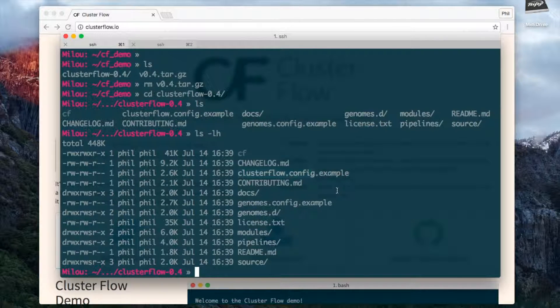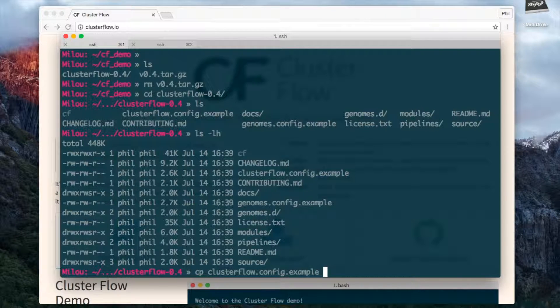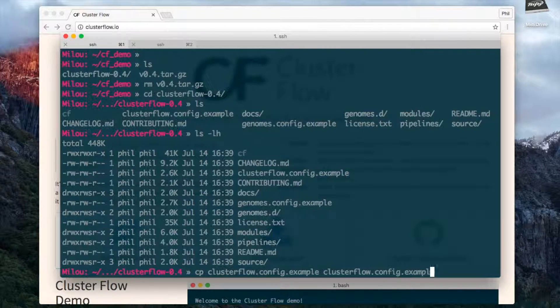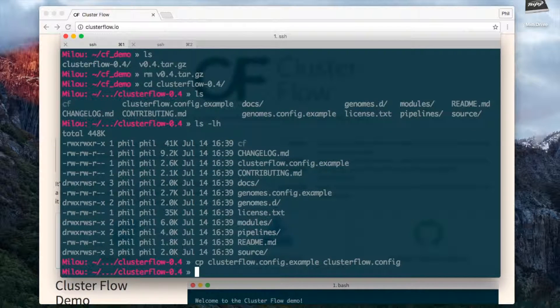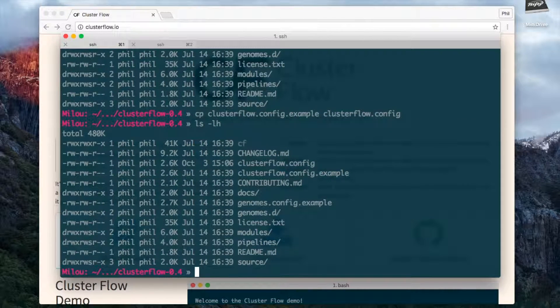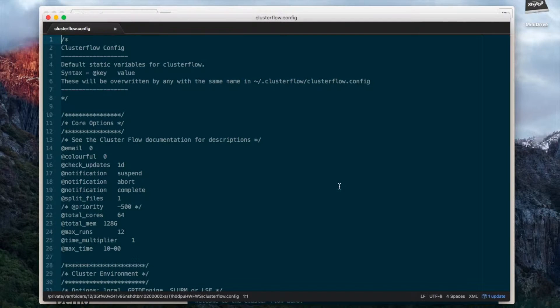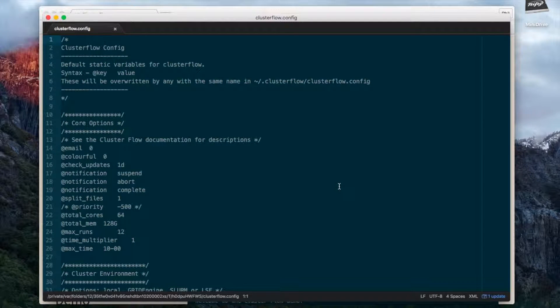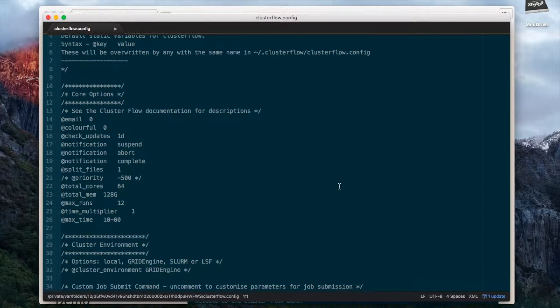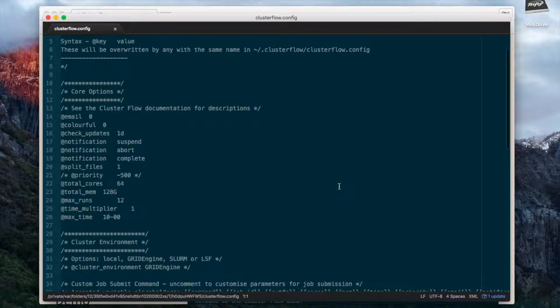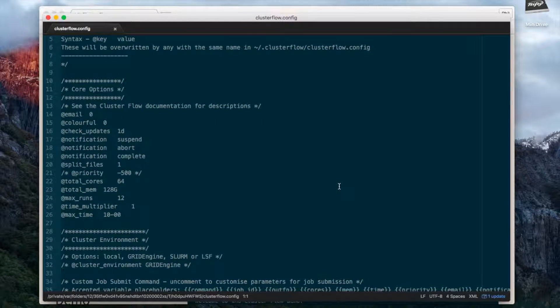There's an example file here which I'm going to copy and use as a template, and I'm just going to get rid of the dot example so it's called clusterflow.config. I'm going to edit this with my editor of choice. You can see it's commented so you can go through and read and understand what everything's going on here. This is all documented on the website as well.